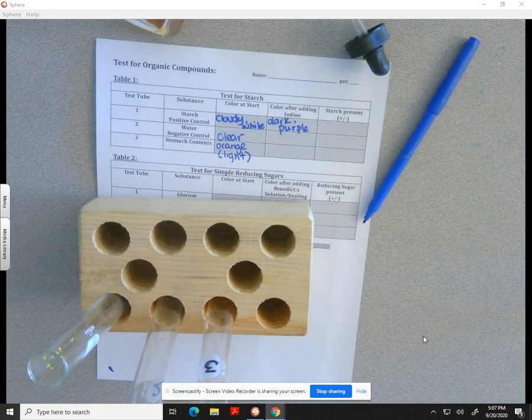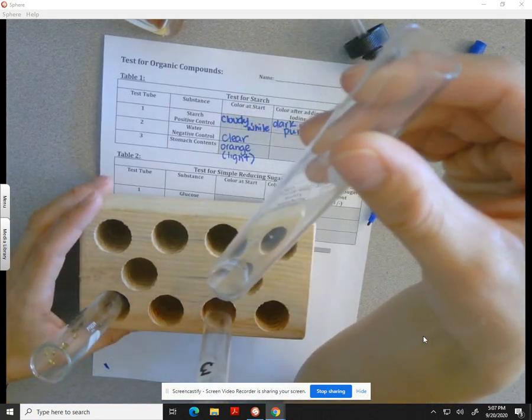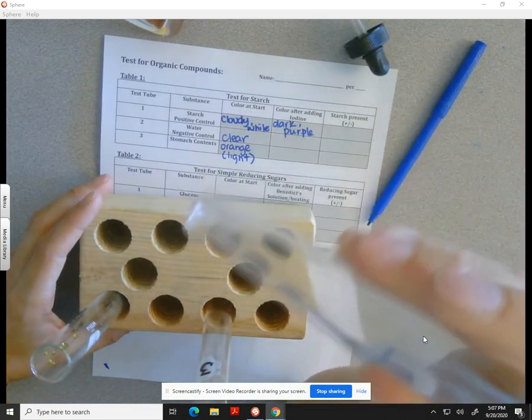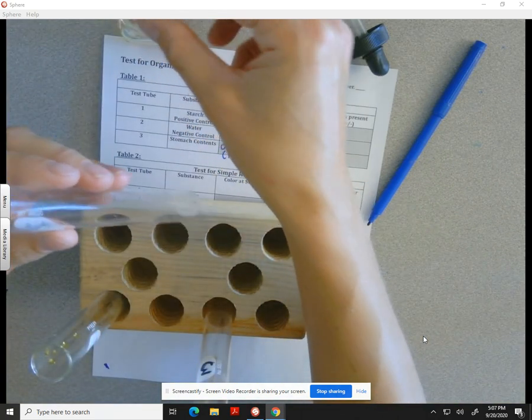Okay, now what we're going to do is we're going to do the same, except for this time we're going to add our drops of iodine to our water and see what kind of result we see after that. So we're going to go ahead and take our dropper again. I'm going to add 3 drops.